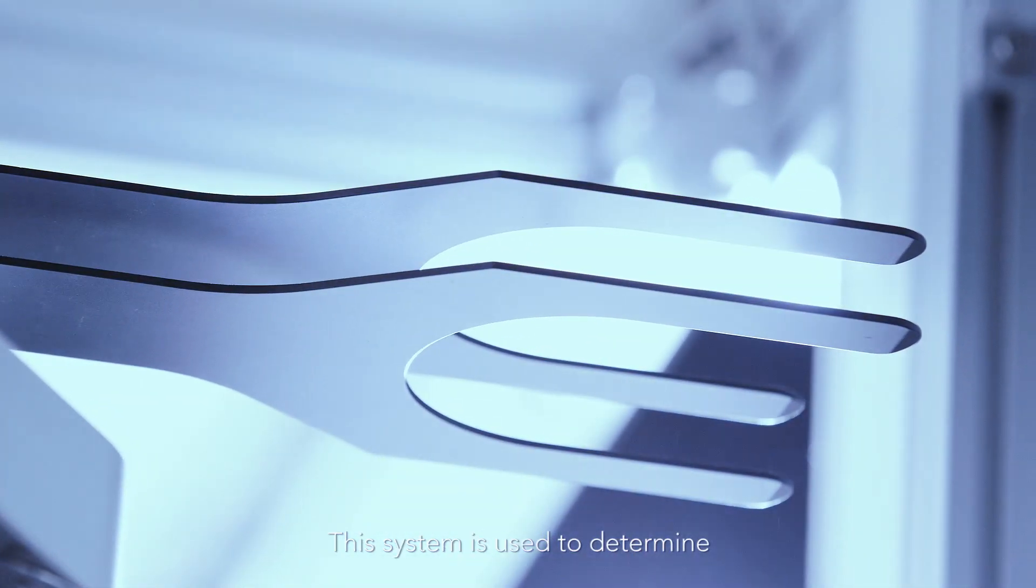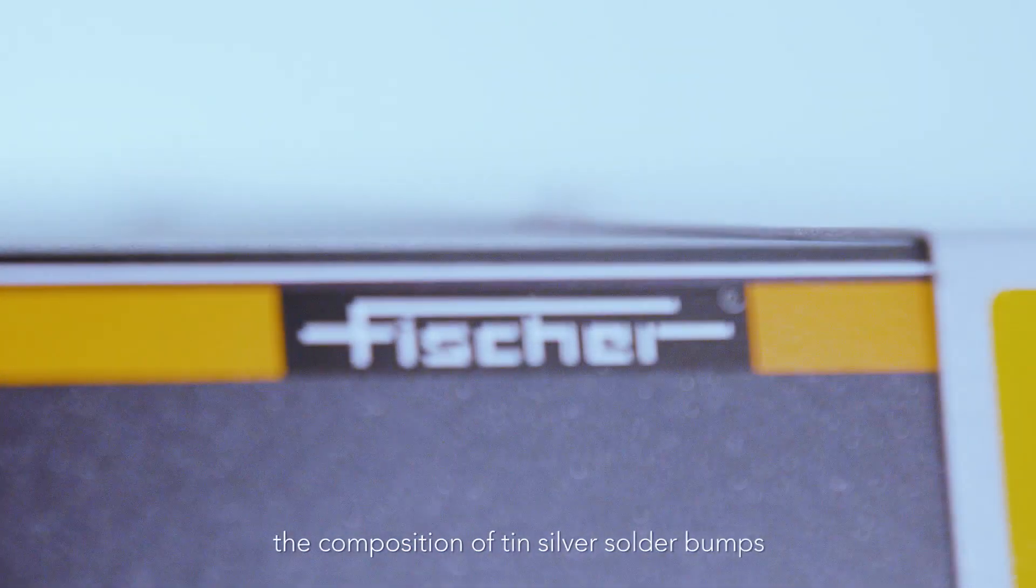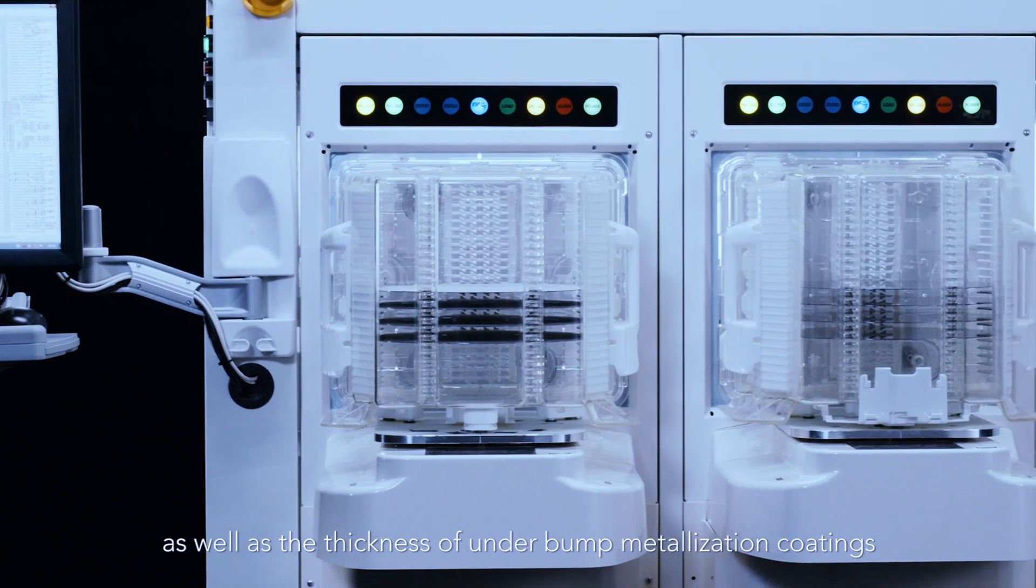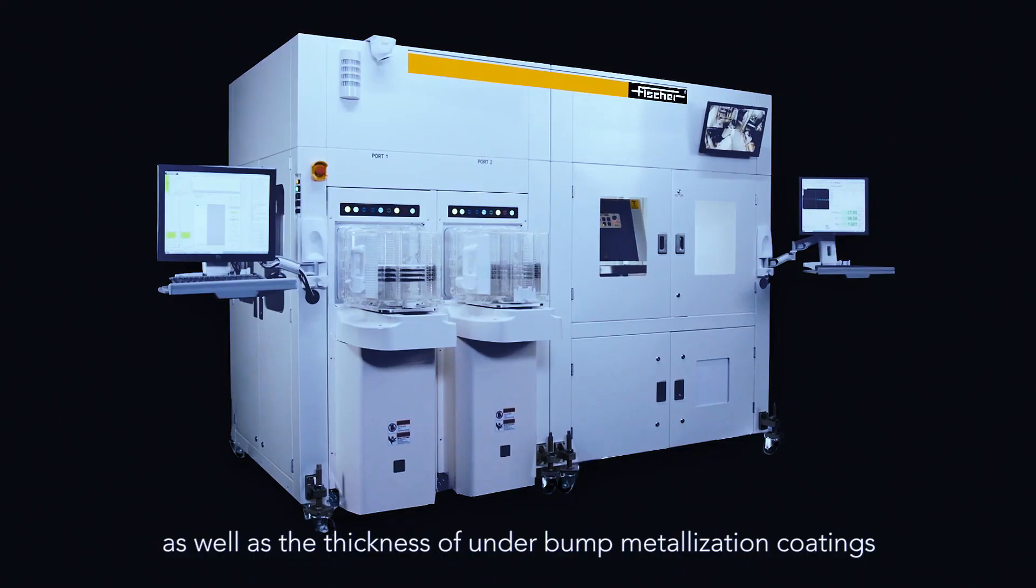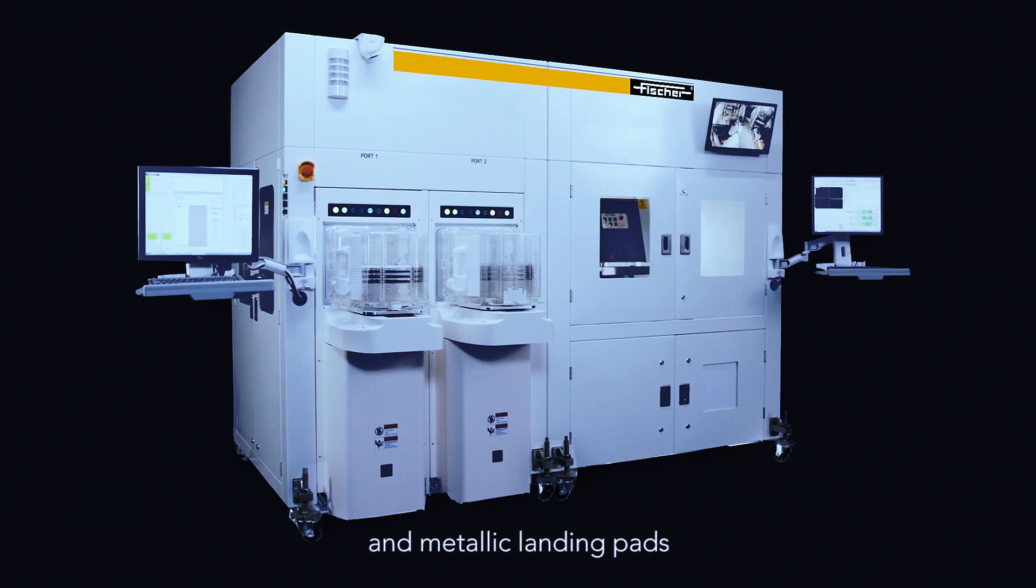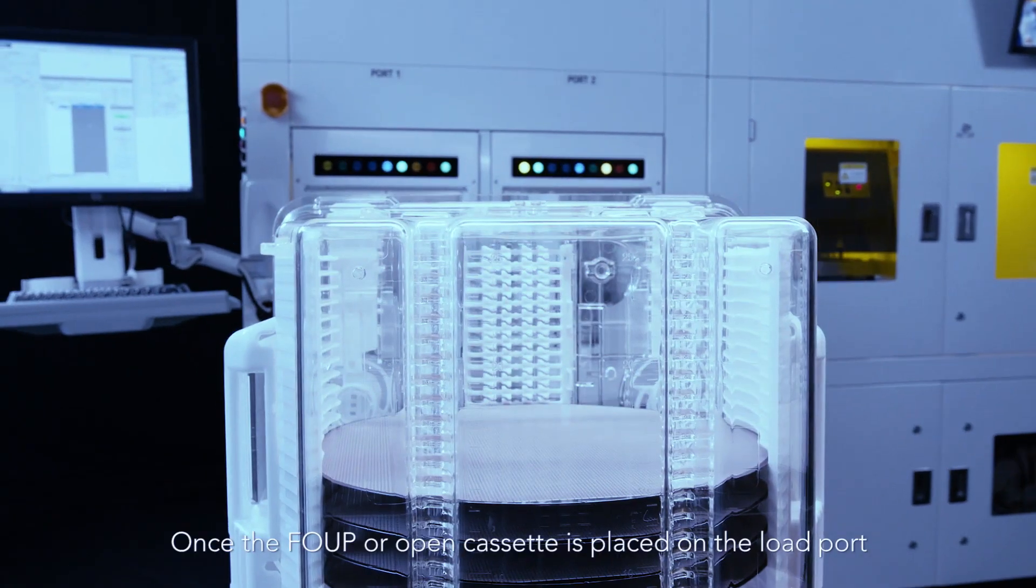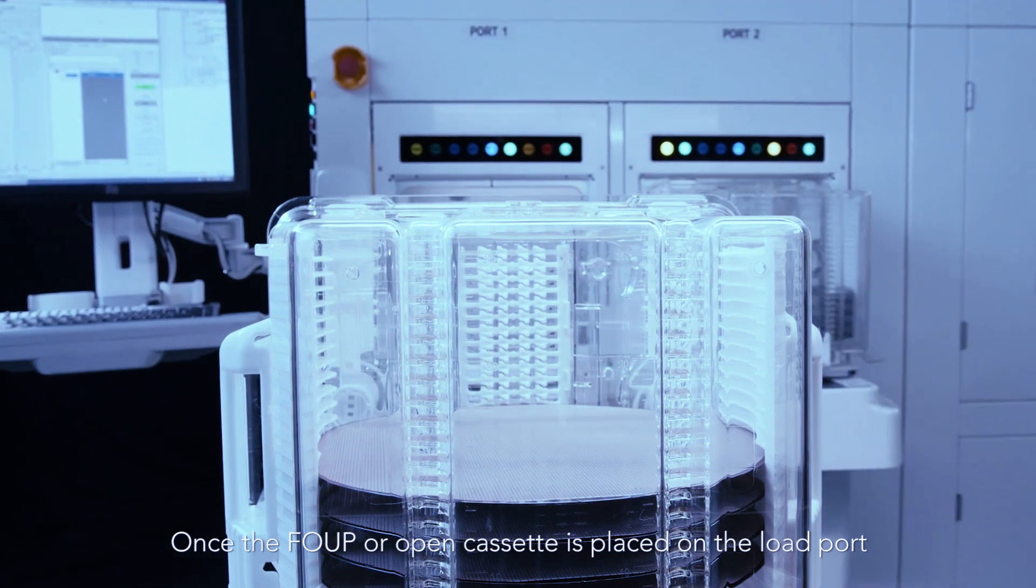This system is used to determine the composition of tin silver solder bumps, as well as the thickness of underbump metallization coatings and metallic landing pads. Once the FOUP or open cassette is placed on the load port, the system will read its ID.